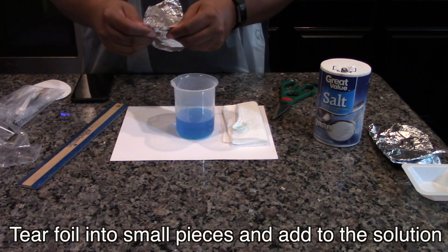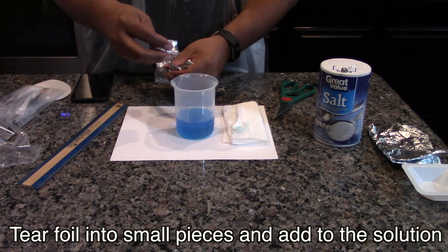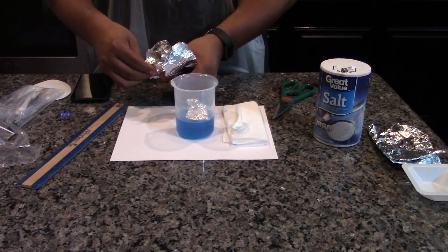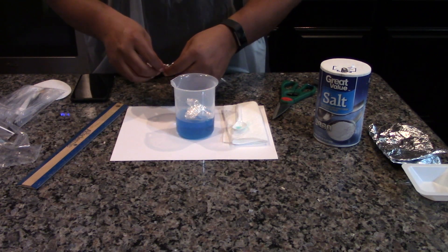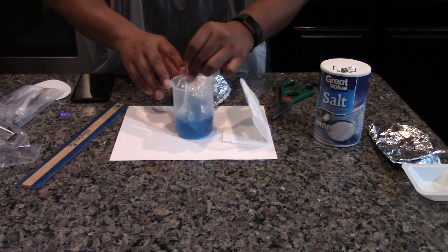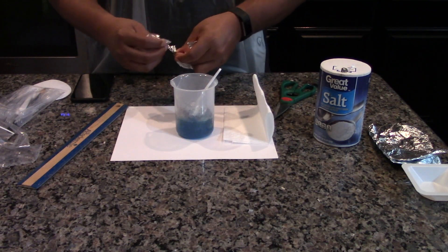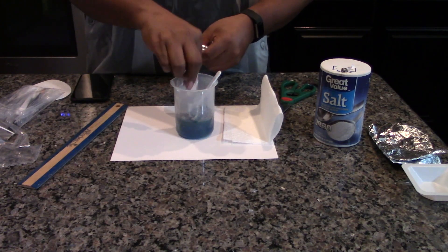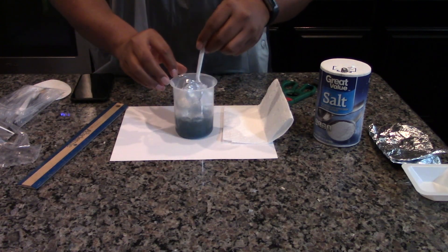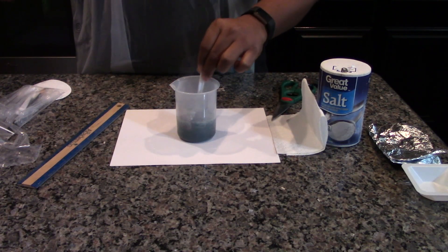Tear the aluminum foil into small pieces and add them to the copper sulfate solution. Note the solution will get hot, but not hot enough to harm the plastic beaker. With a plastic spoon, stir to mix the aluminum foil in the solution. Record all your observations.